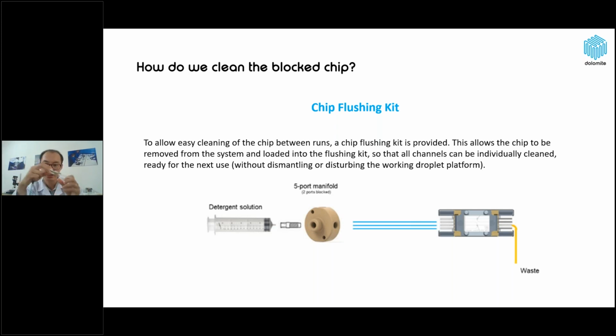In case of chip blocking, if you want to try to resolve it, you can do so by connecting the tubing in the reverse direction. The input of the solvent, connected with the tubing, will be connected to the output of the chip, and the tubing is left free at the input of the microfluidic channels.